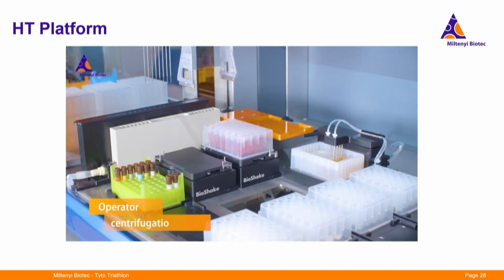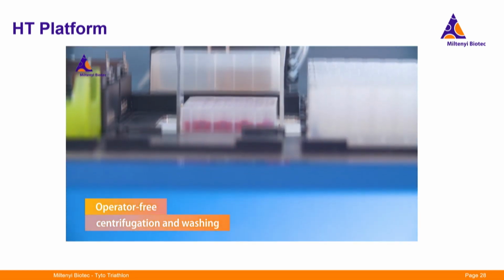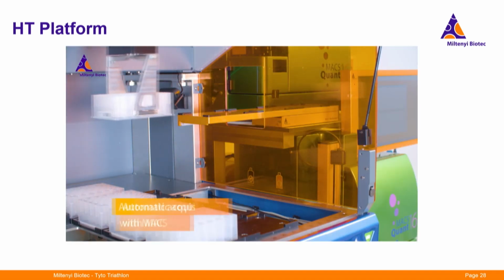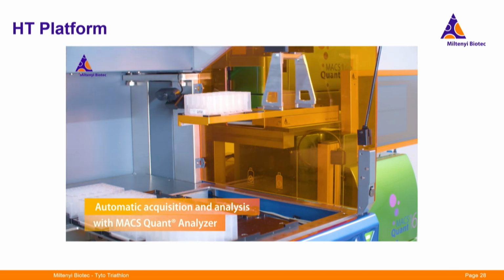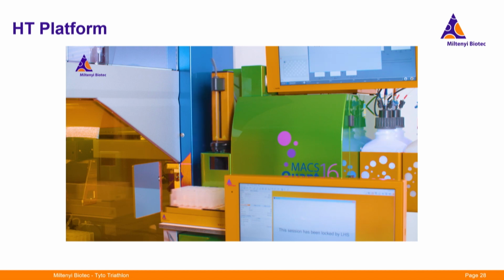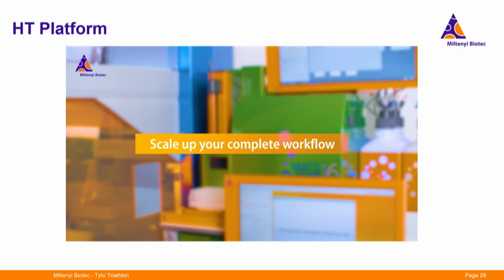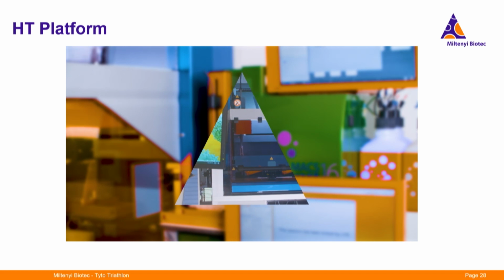The suspension, that is a shaker, and then the arm moves the plate into the centrifuge down where the washing happens. And then it gets transferred to the flow cytometer. So there is where the detection of the cells happens, and now the needle arm comes down and sucks in the sample. Okay, so that was one example.